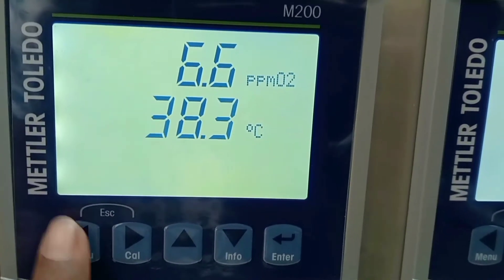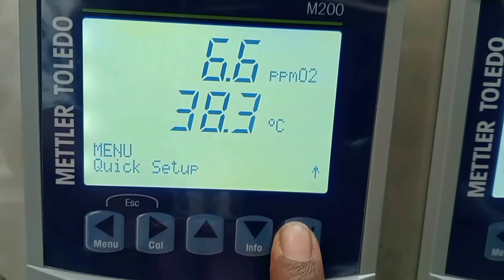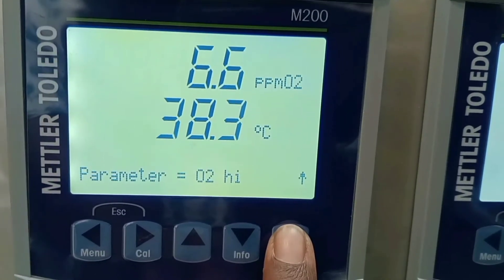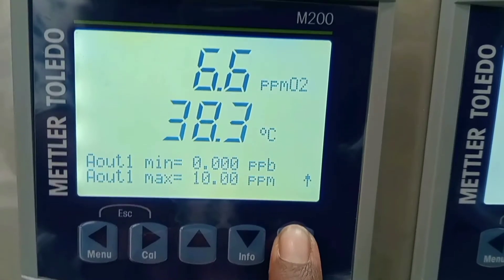Now I will demonstrate the calibration procedure. The first step is configuration of the transmitter. Press the menu tab, select the quick setup option, and then press enter. Again enter. Now it will show a parameter selection — I have selected O2 high.